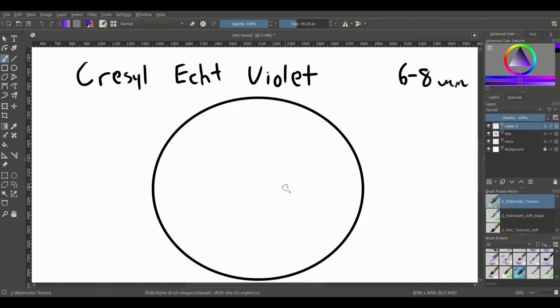Once we stain everything, we're going to rinse that in distilled water, and then place them in 95% alcohol, and then put them into xylene. Now we're going to do something interesting with this. We're going to put them into a xylene balsam mixture, and our differentiation step comes after this. As far as why using balsam, my guess is to protect the Nissl substance.